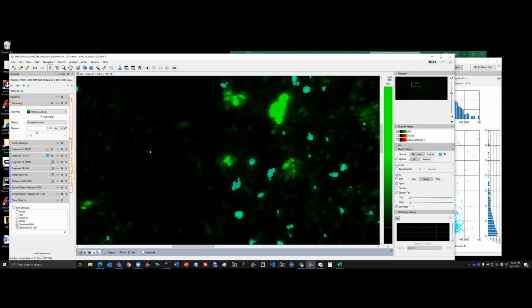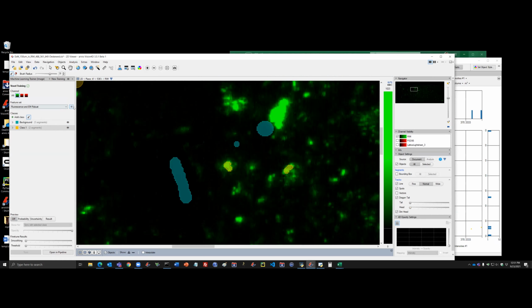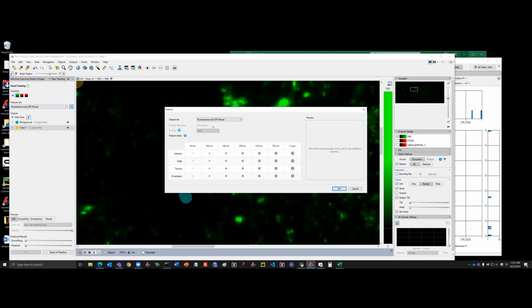Right now we can customize the features that it takes into the analysis. In the custom version, we would have a certain size and 4 groups of features that we can use. Also, it can be downscaled.